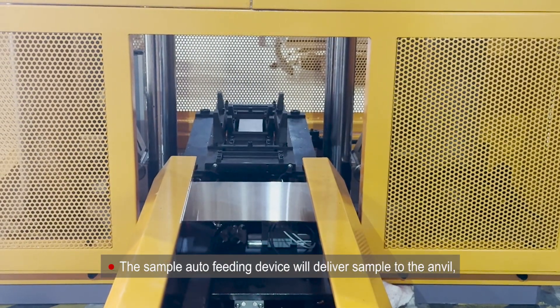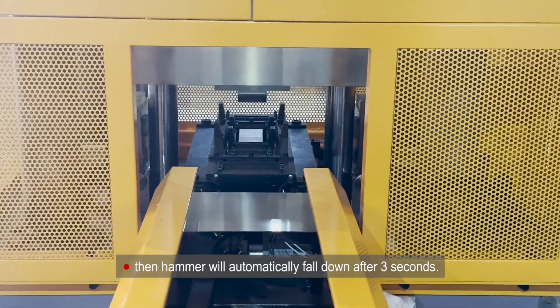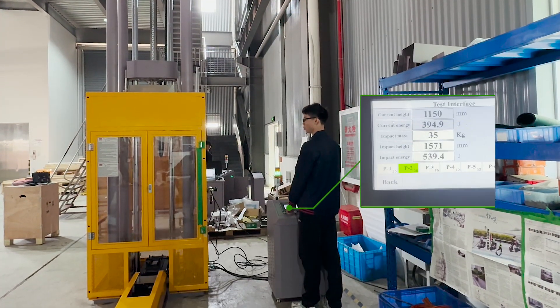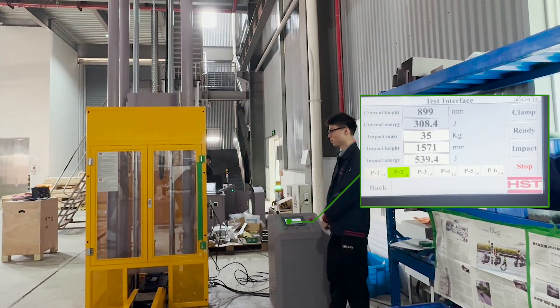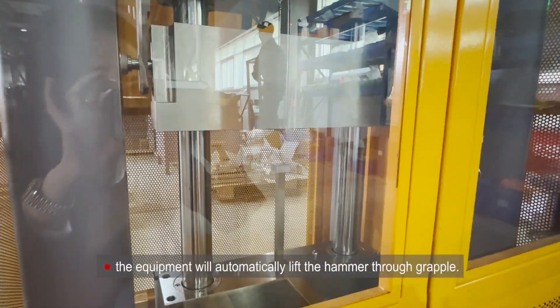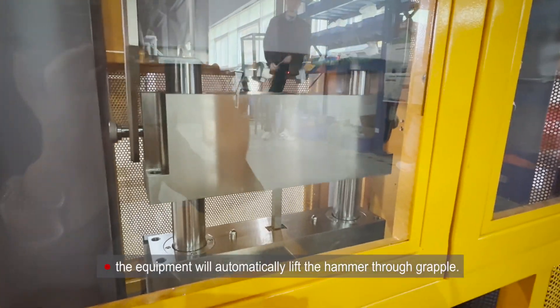The sample auto-fading device will deliver the sample to the anvil. The hammer will automatically fall down after 3 seconds. Once the impact is complete, the equipment will automatically lift the hammer through the grapple.